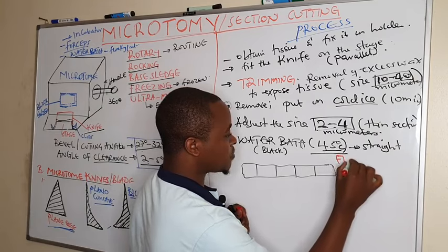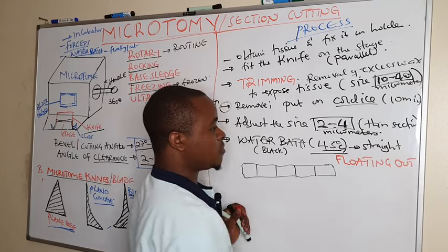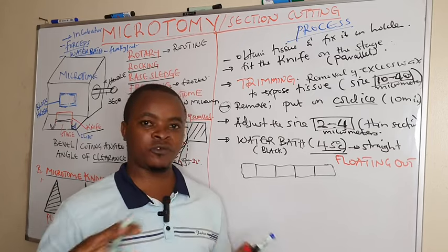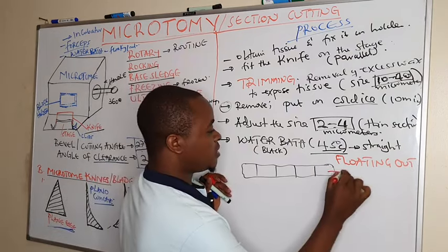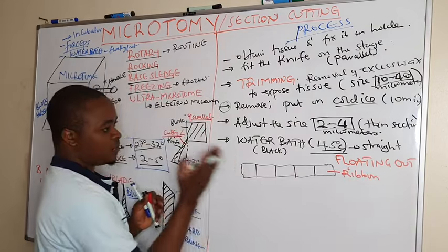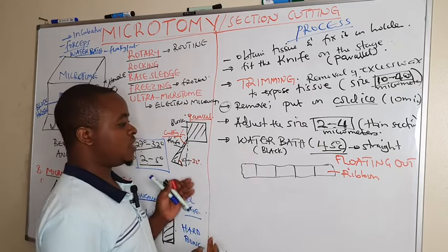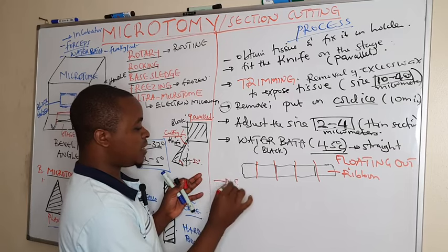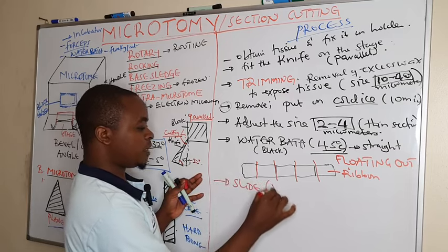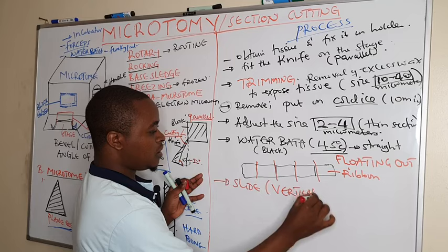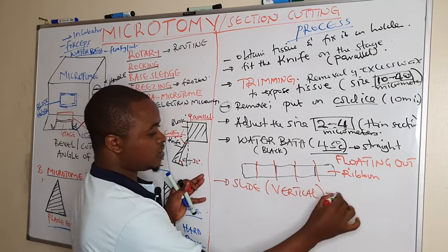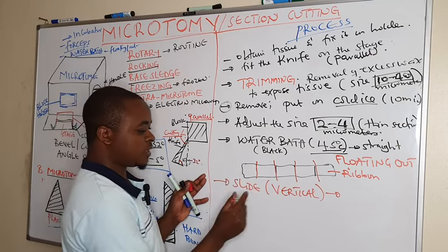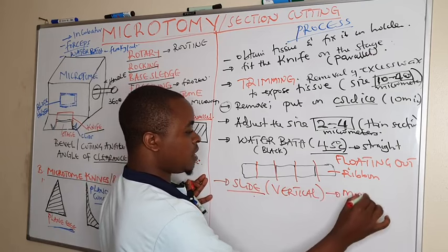The major significance of froting out is to straighten the ribbon or to remove any wrinkles or folds within the ribbon. After placing the ribbon in the water bath, we use forceps to cut the ribbon into different sections. We then obtain a microscope slide and press it vertically in the water bath to mount these sections on the slide.